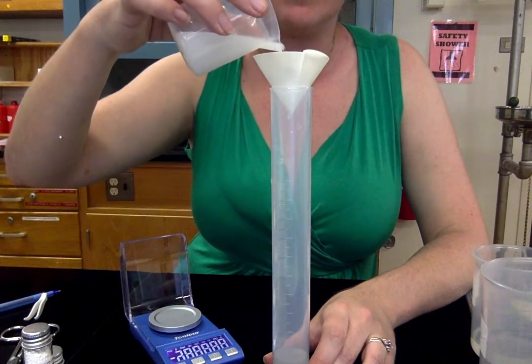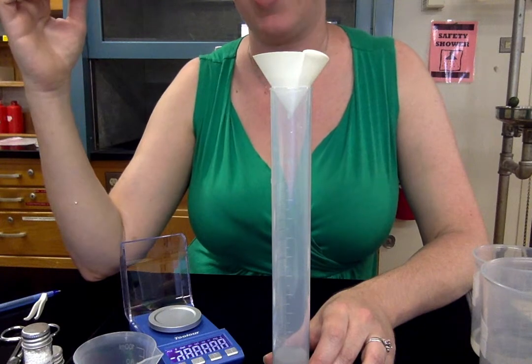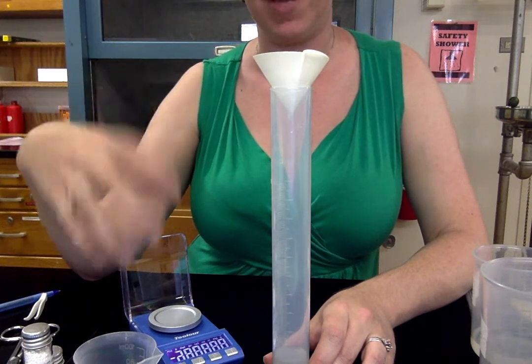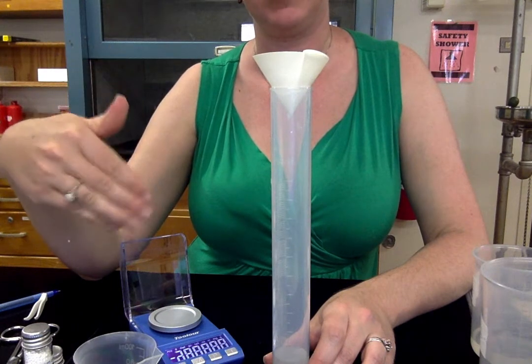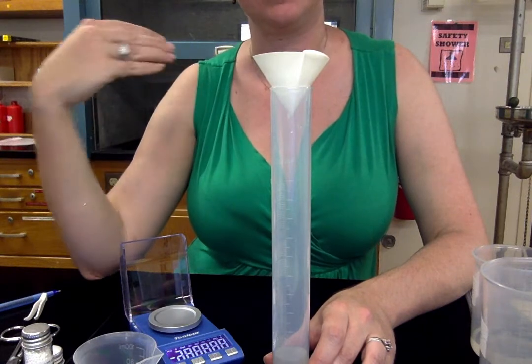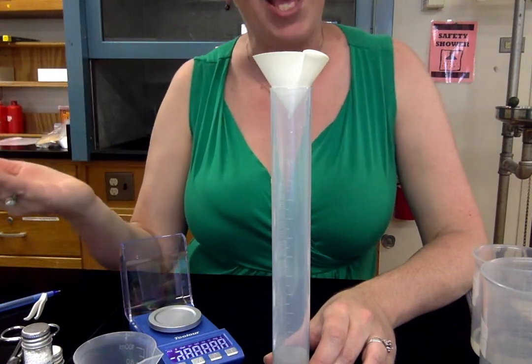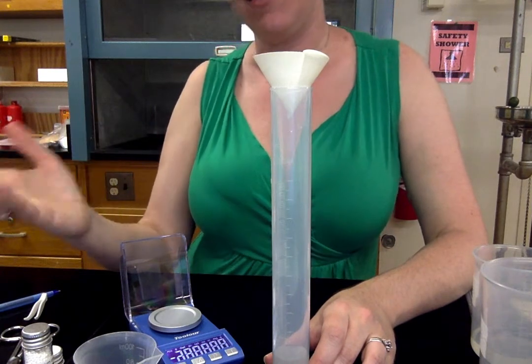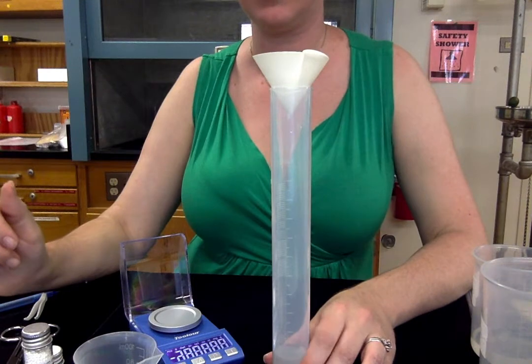So once it is completely dry in 24 to 48 hours, you'll take the mass. In fact, you'll mass it several times to make sure that you get it when it's completely dry. So when the mass is no longer changing, you know it is completely dry. And that is your actual yield. And you'll compare that in your calculations to your theoretical yield.